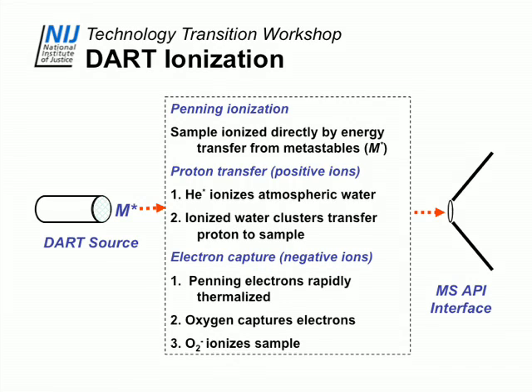Here are the three steps in a schematic, and both of these figures are the ones that we put on Wikipedia. The first step is Penning ionization. We'll break these down one by one and do them in detail in just a minute. But Penning ionization is when you have a neutral molecule that interacts to produce an ion with another material. It's called chemionization when you start with a neutral and you wind up with an ion.